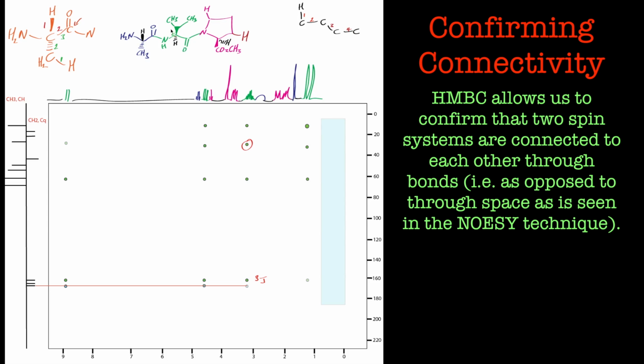So the two things to note here. First of all, you can identify the quaternary carbon using this technique, and secondly, you can go through a heteroatom to actually get a through bond correlation, and by doing that we are now able to identify that that valine is connected to that alanine subunit there. So you've got your first connectivity in the series. Just like we used a NOESY to identify connectivities, we can actually use HMBC very efficiently and powerfully to define the connectivities as well. So that's really useful, and that's what I use it for quite a lot.